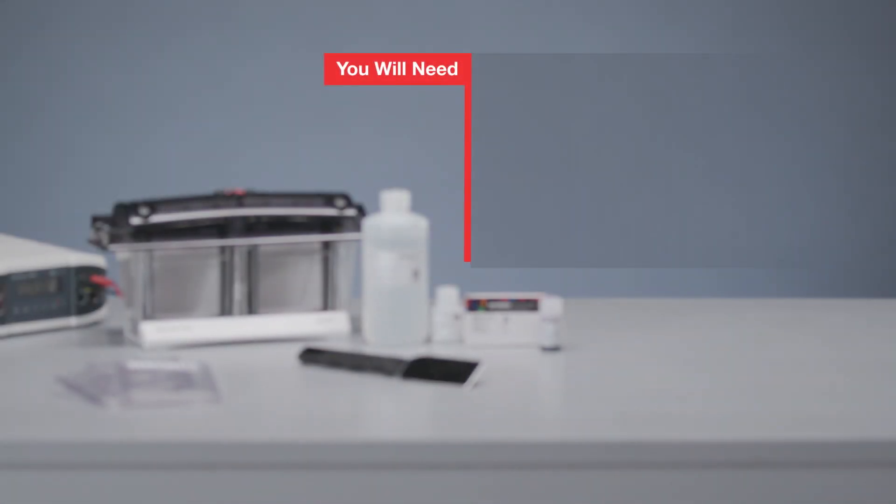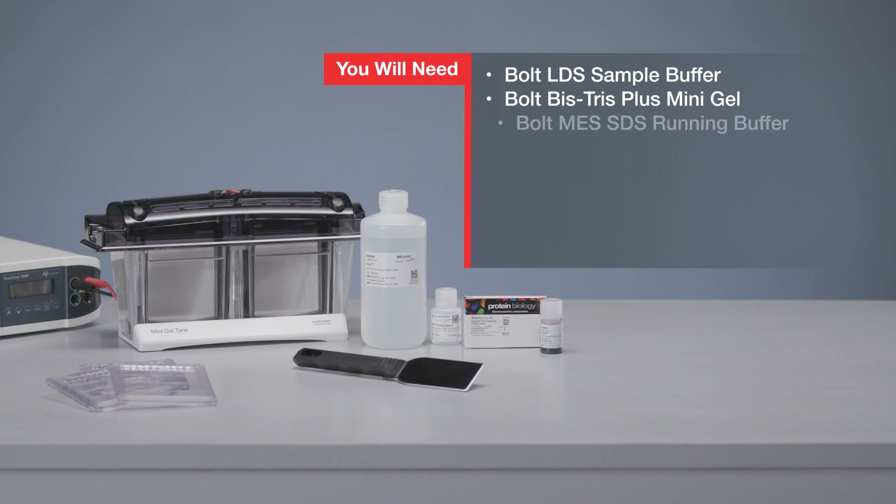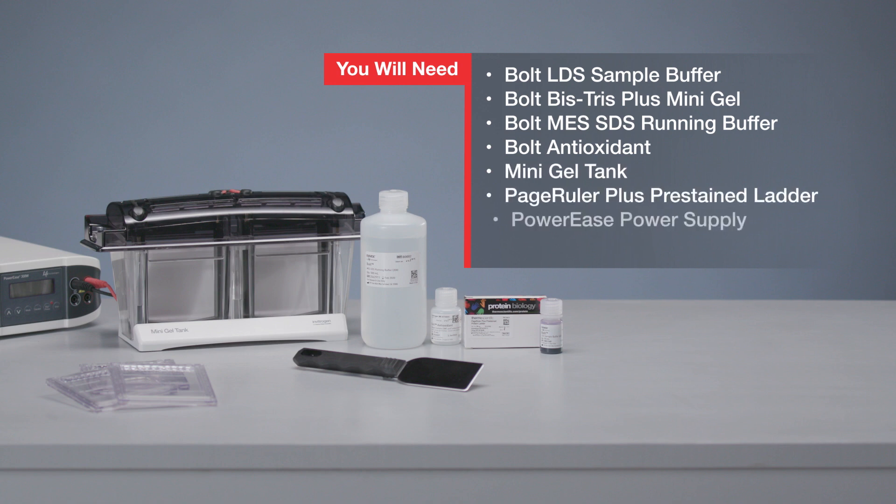To replicate what you see in this video, you will need: Bolt LDS sample buffer, a Bolt Mini Gel, Bolt MES SDS running buffer, Bolt Antioxidant, a Mini Gel Tank, a PageRuler Plus pre-stained ladder, a PowerEase power supply, and a gel knife.